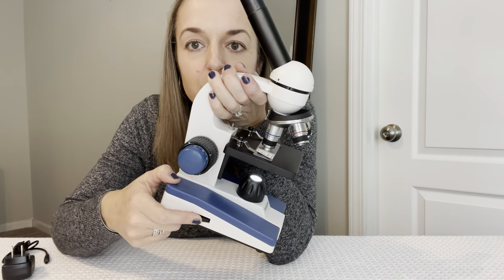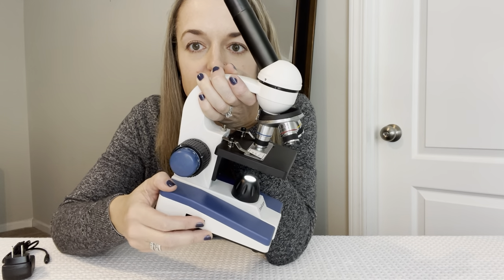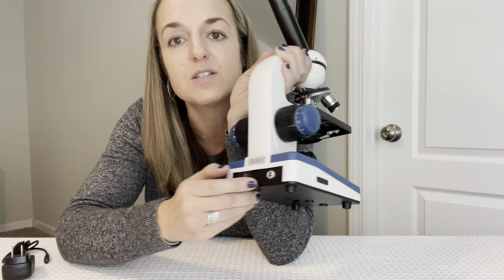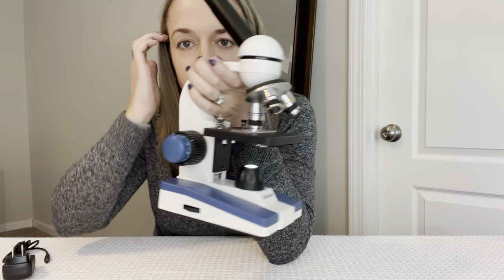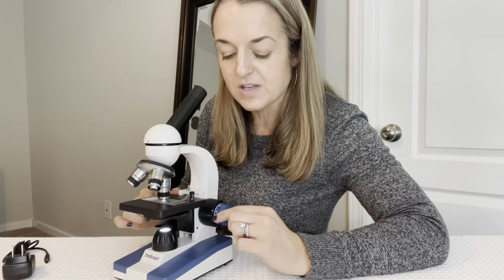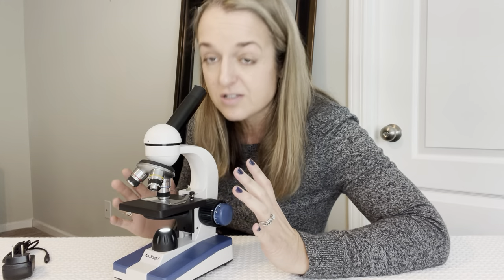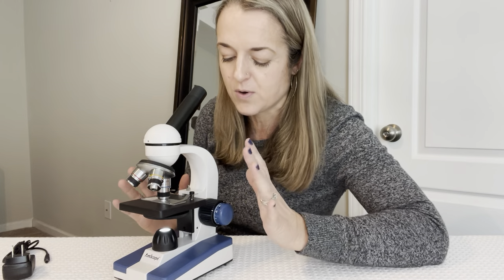This dial here on the side will adjust the light. Do you see how the light is adjusting down there? This is where the power cord would plug in. And then here on the side, the blue dials control the focus, and these are so sensitive to touch, which I really appreciate, so that you can easily get it into focus.